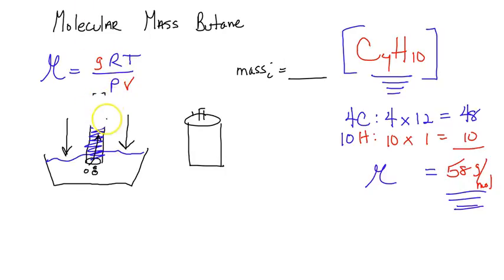And what's going to happen is the bubbles of butane are going to push the gas downward. So as the bubbles come to the surface, okay, the bubbles come up, it's going to push the liquid out. So we're going to displace it. In fact, what you're doing is you're adding gas molecules up here, and these gas molecules are pushing in all directions, including pressing downward.